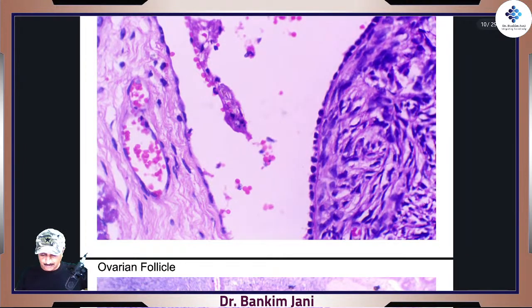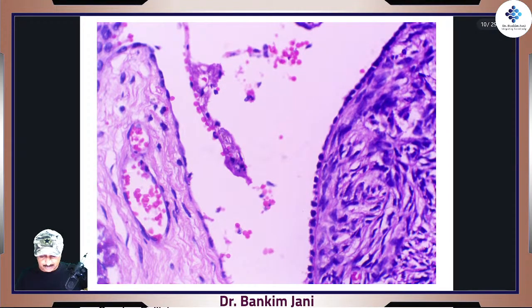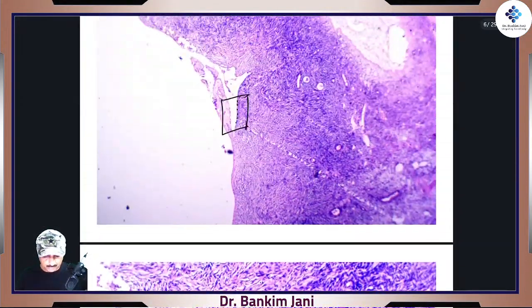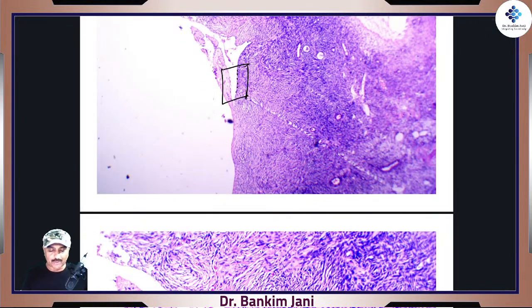Okay. Another view, another angle, right? This particular image is in fact from the same slide, right? This view, what you are watching, it is this part, this portion. Yeah, here it is, what I marked, right? Only this much area.